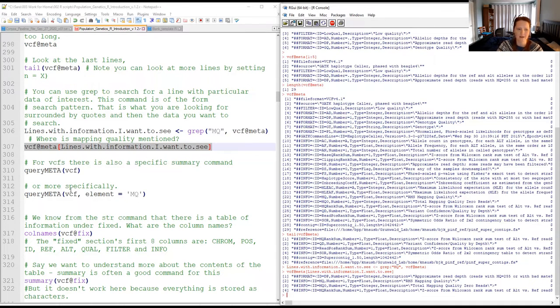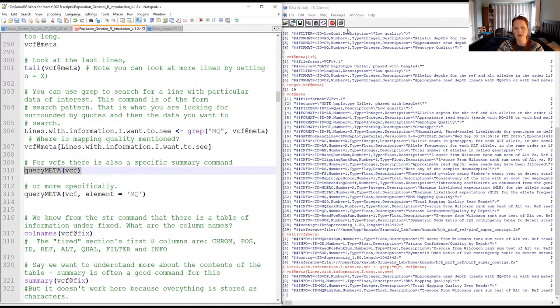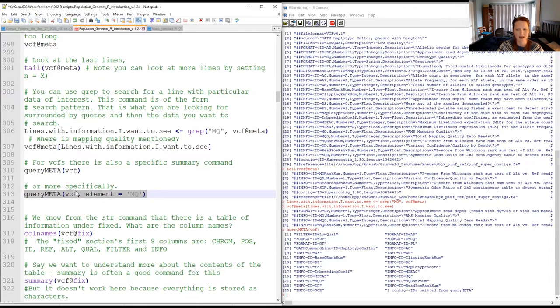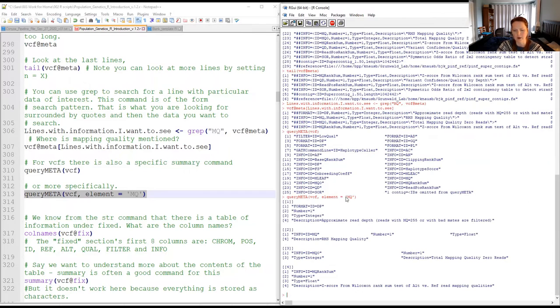vcfR is nice in that it has specific commands developed for querying different portions of the file, making it more user-friendly than many other packages. They have a command called queryMETA(), which gives you the same sort of information a little more easily. You can also use it specifically — for example, querying just the mapping quality metadata — by passing the command very specifically, telling it what to look for in the metadata.